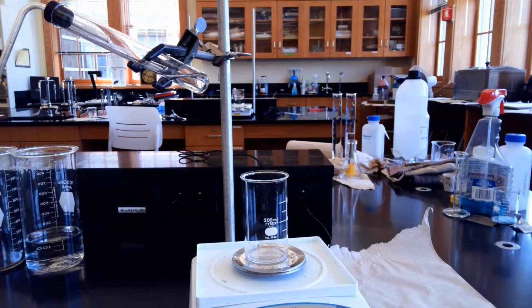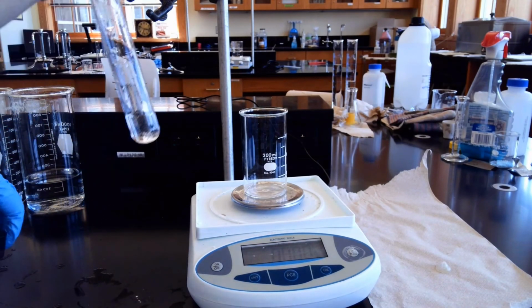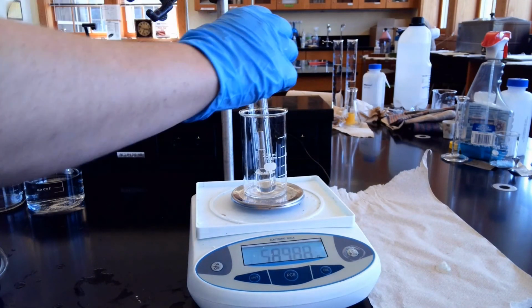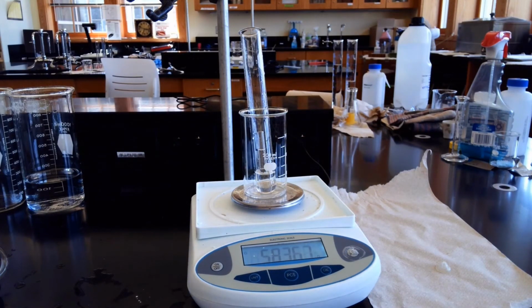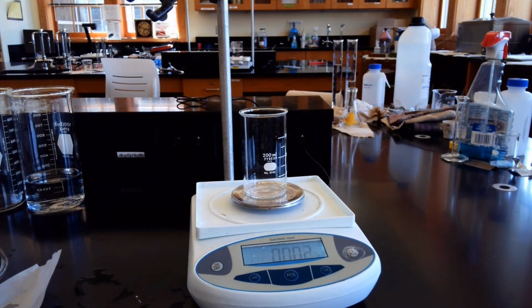So we can get the mass on the balance. So we're just going to unhook ourselves. And our mass is 58.367. But, hold on. I'm going to do this first. I realized I had some wet hands. That's going to lead you to some errors. So let me just wipe down this from my wet glove. Just going to wipe the water from my glove off. Wet gloves are no help.